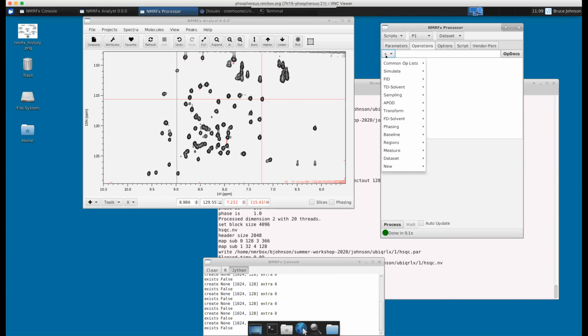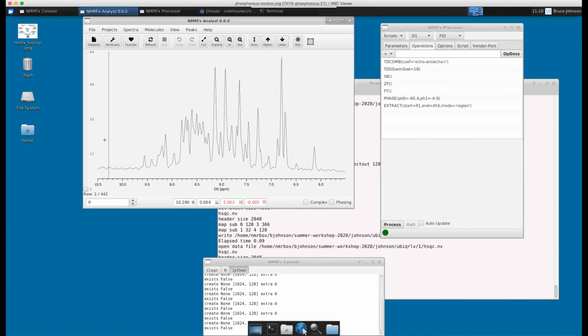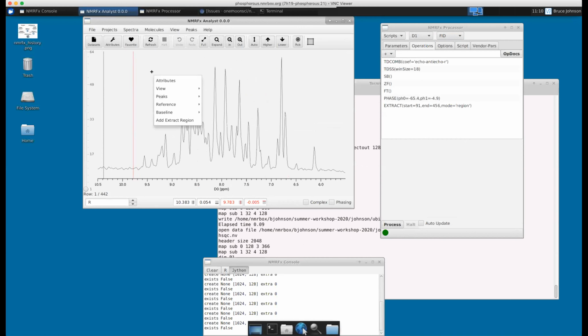So let's insert a baseline correction. Baseline, a little different than some people, I actually divide baseline into two things. One, defining what regions are baseline, and you can insert a regions command. If I was back in FID mode there, I can come up and put crosshairs up and insert baseline regions this way and add that in and find regions of baseline across the spectrum.